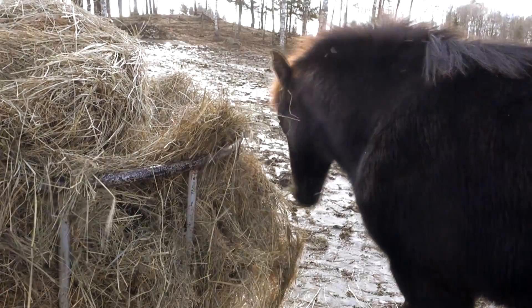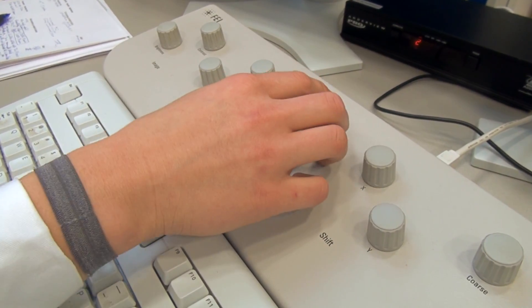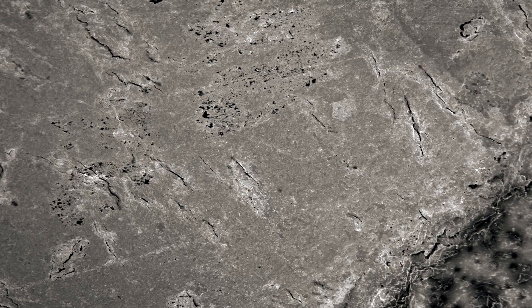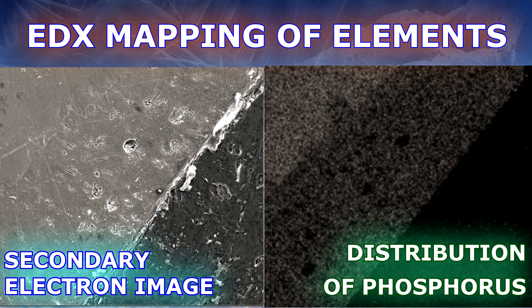The enamel also appears to be less porous than the dentin. This makes sense as the enamel of a horse tooth has to withstand chewing a variety of foods that include carrots, twigs and grass. The very top layer of the enamel has a slightly different appearance. A higher magnification image clearly shows that about 140 microns of the enamel's top layer is littered with countless microscopic cracks. Mapping the distribution of elements in the same region with energy dispersive microanalysis also reveals that the surface layer has been slightly depleted of calcium and phosphorus. This also explains why the surface had become weaker.